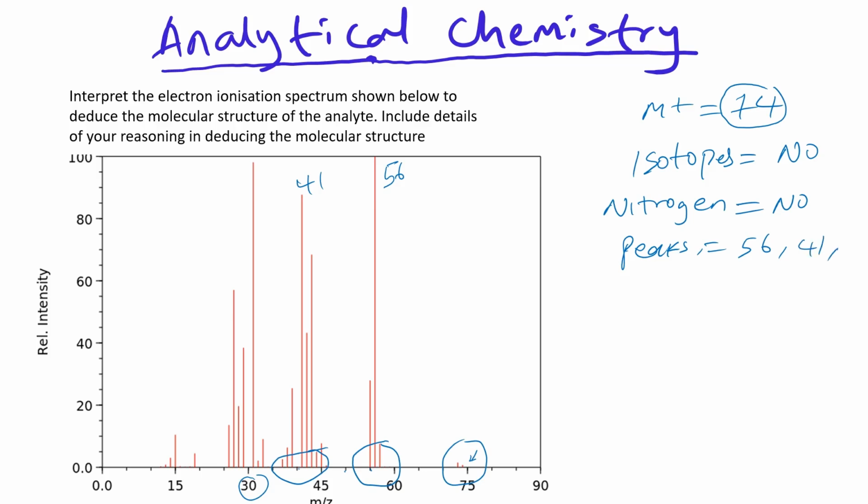And let's look at this cluster here. This cluster here, we have the tallest peak at 31. Okay, and this cluster here we have 15. Now, which of these clusters can you find interesting here? That is the peak at 31 here.